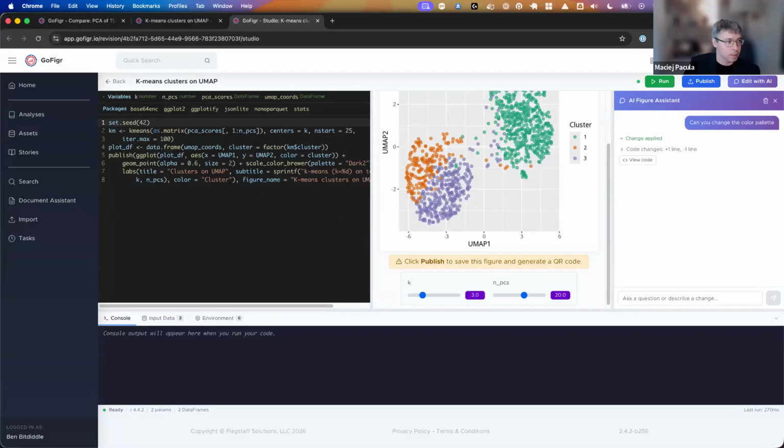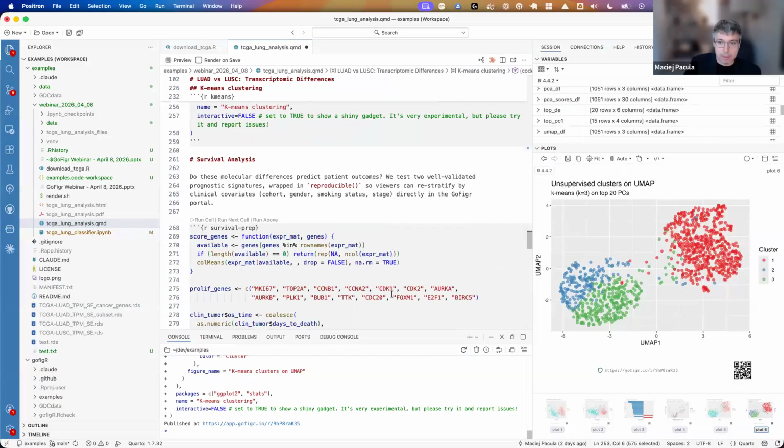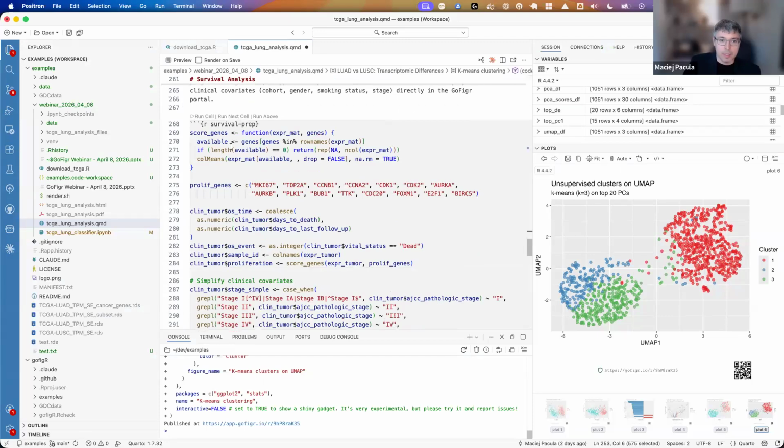So let me jump back to Positron so I can show you the other analyses. I think this whole concept of clean rooms is particularly powerful in biotech, where, as you know, notebooks are usually pretty messy. So being able to carve out those reproducible capsules within the notebook that you want to ensure you can always rerun later, I think it's a pretty useful idea.